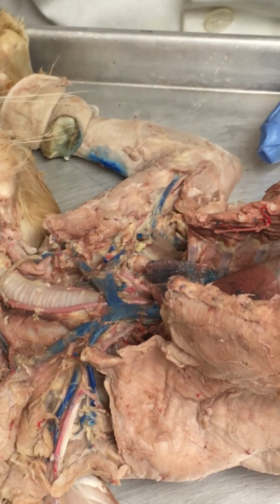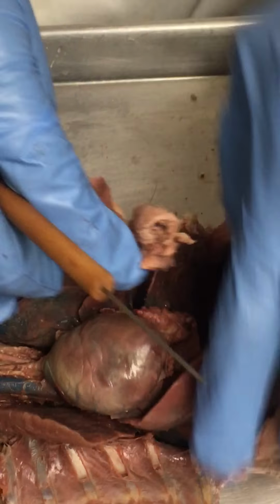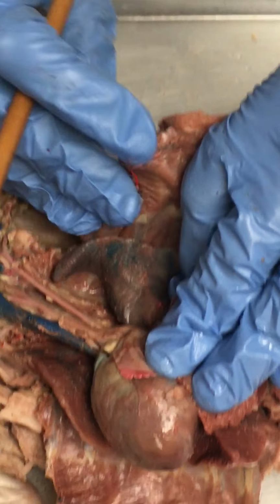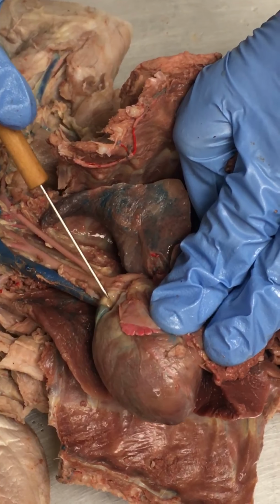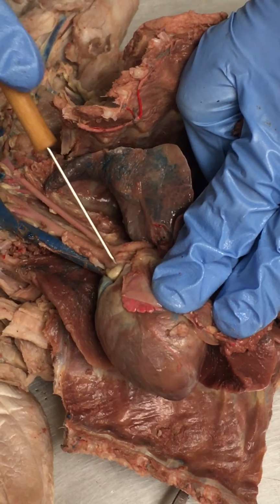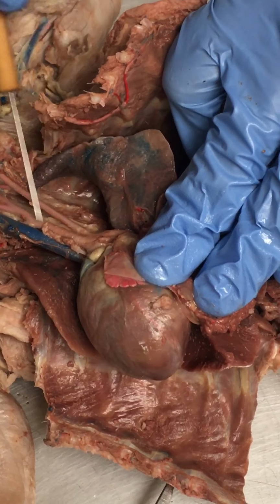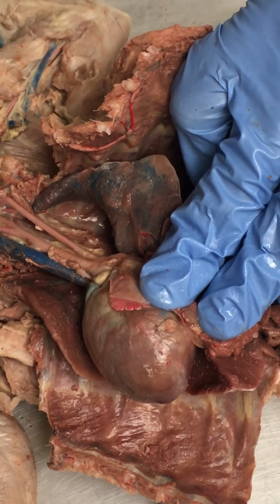Okay, so let's go through the arterial system. So aortic arch, this will be a little bit difficult to see for everybody because of the lighting in here and the contortion of the kitty cat I have to do. But you can see this is the aortic arch. There's a little bit of fat right there that we could remove, but it goes out of the left ventricle and turns and goes down. So that structure is the aortic arch. We know it's the aortic arch because these two major arteries branch off of it. Just below that, we've got the thoracic aorta.